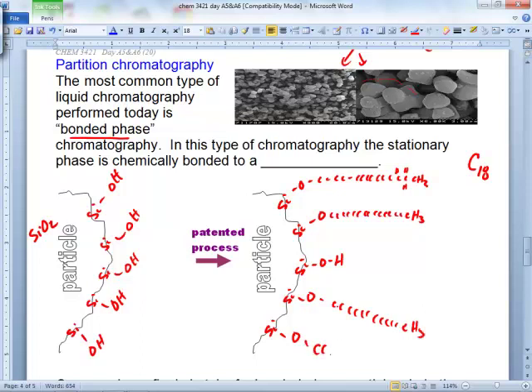And one more down here. I'm not even counting. I'm just putting a whole bunch on there. Okay, I'm trying to make a C18 column, though. Should have made it something easier, but this is the most common. Patented process. But they can't get them all.